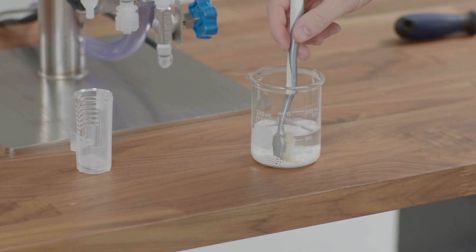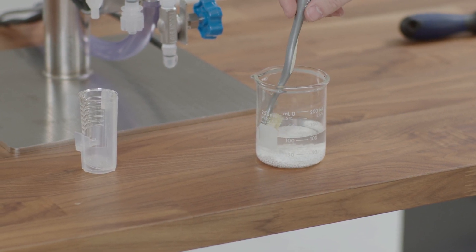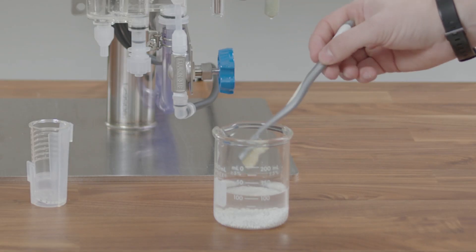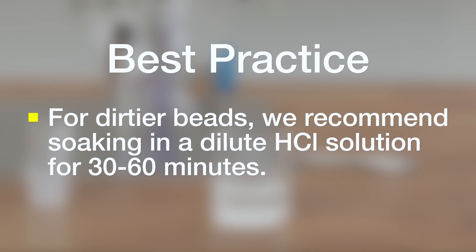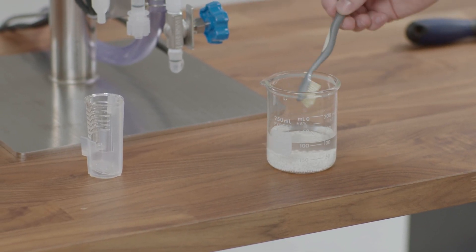If you're cleaning the beads, you have a couple of options. You can either use just a mild detergent and clean water to clean the beads, and then the same toothbrush you used to clean the cell can be used to mix the beads up and help get rid of any buildup on them. For dirtier beads, we recommend using a dilute HCl solution and letting them sit for 30 minutes to an hour, and then you can take that toothbrush and mix it up and knock off any remaining buildup.